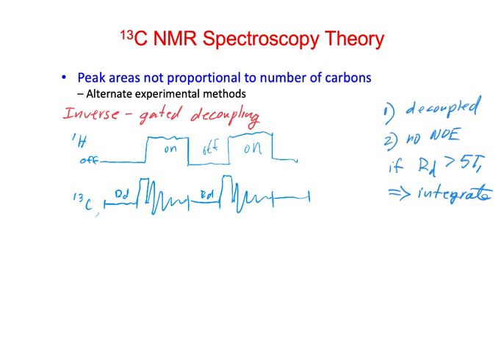But if you specifically needed this information, you could run that experiment, right? You could integrate the carbons. But in that scenario, you will have a lower signal-to-noise ratio. Yes, absolutely. So either if you had enough sample that signal-to-noise wasn't a big problem, or if you just ran it for a long time. To get the peaks. Yeah.